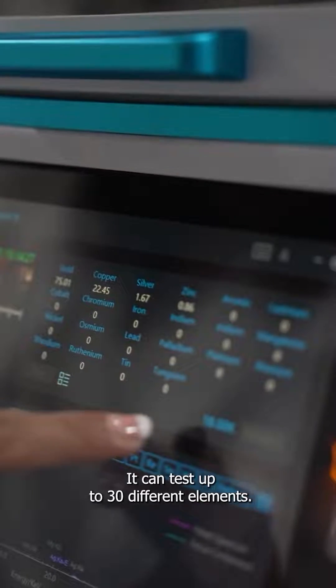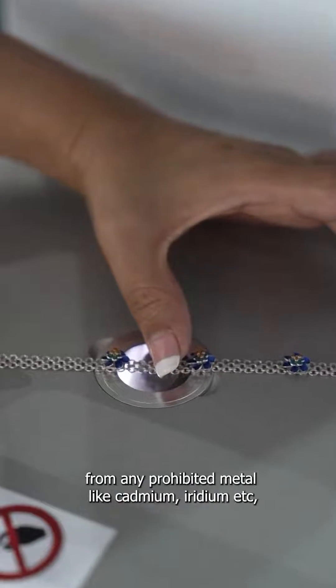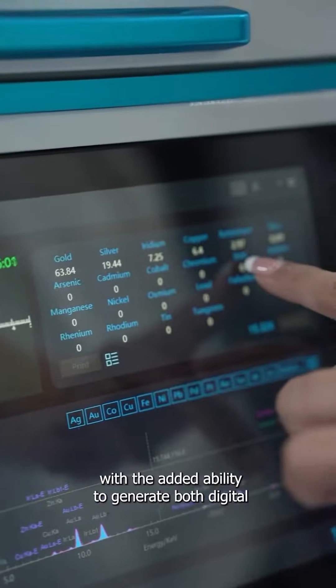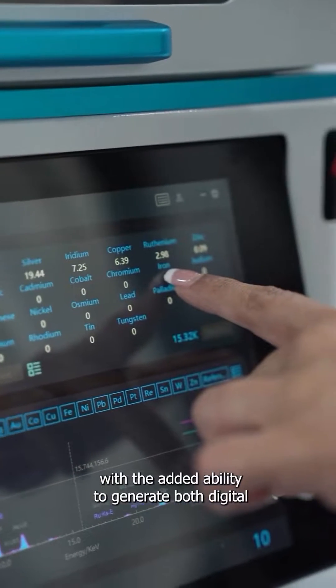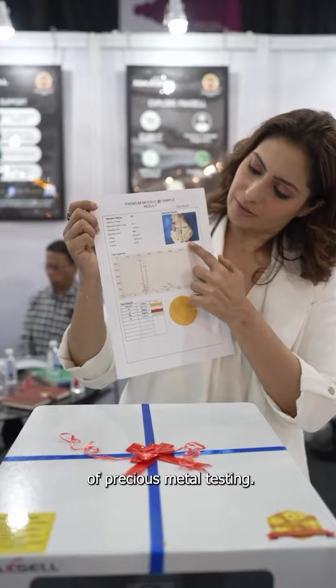It can test up to 30 different elements. Imagine having the power to check if the jewellery is free from any prohibited metals, with the added ability to generate both digital and printed information copies. It's a game changer in the world of precious metal testing.